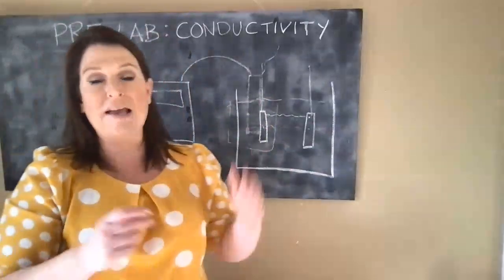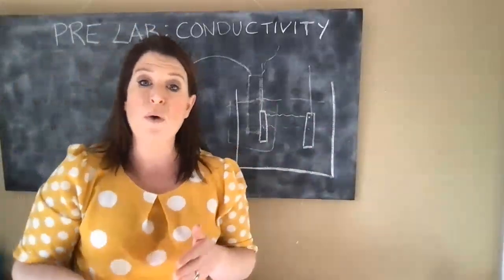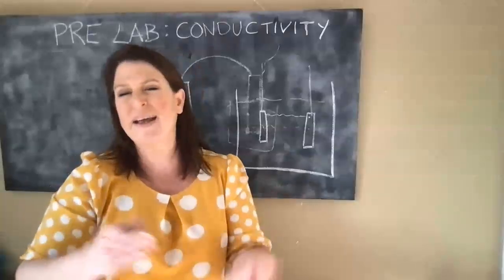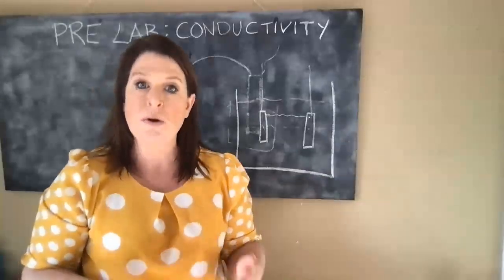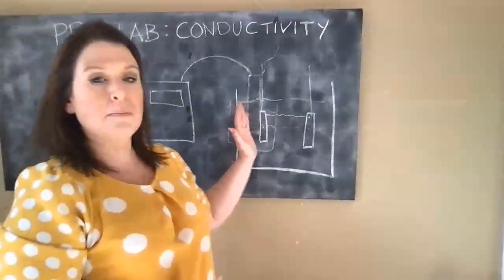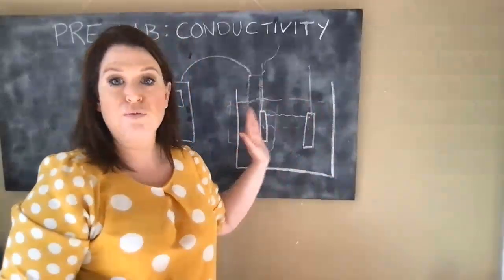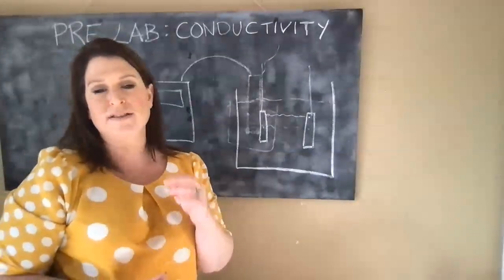They're all the same size. The nature of them isn't different, but you'll see that when you have a solution that has 10 times higher concentration of ions, you've in or around 10 times more ability to conduct electricity through the solution. So this is a trend that you're going to look out for: the ability to carry it from one side to the other. The more you have, the more energy that can be carried from here to here, if each one is doing its own little job. So the concentration of ions is the first thing.